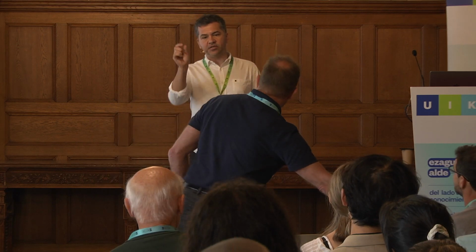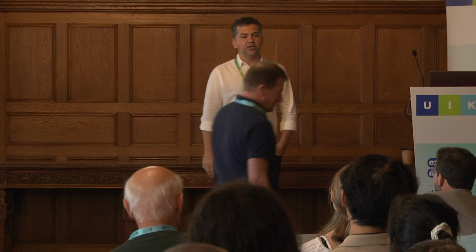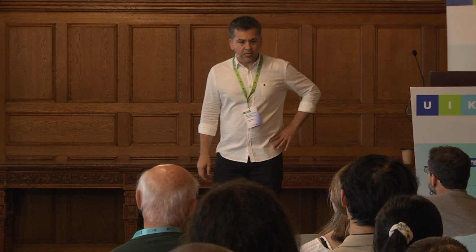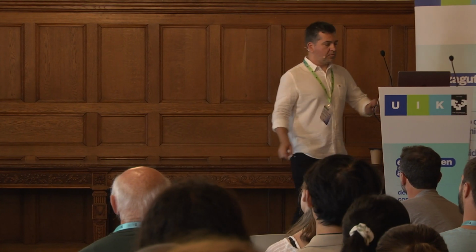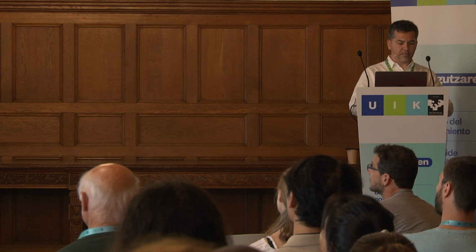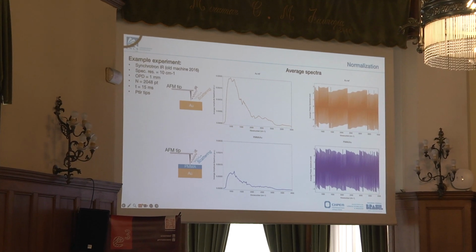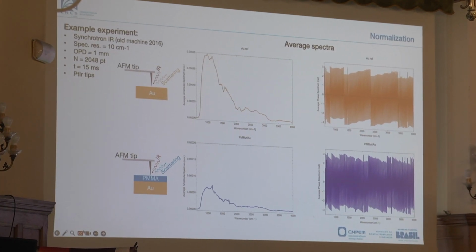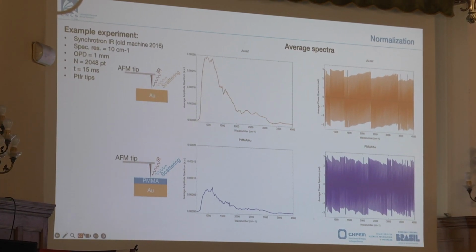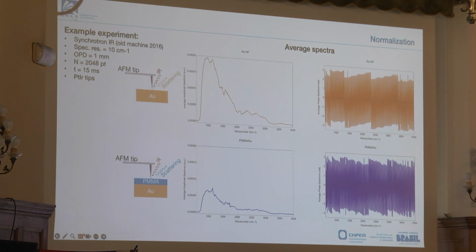But it's all about this advantage of the size of the source. And I would just make a comment and a request to NeoSpec. It's of quite practical interest. So maybe you can show the slide where you show the reference spectra and the sample spectrum. Because that is something that recently came up in my group in the discussion, and I don't want to forget it. You have two phase spectra here, and you see that in the phase you don't recognize anything, right? But if you divide, then this falls off, and these are all kind of phase ramps. And these phase ramps actually are an imaging effect.